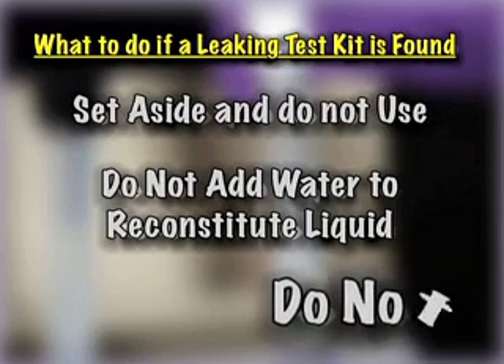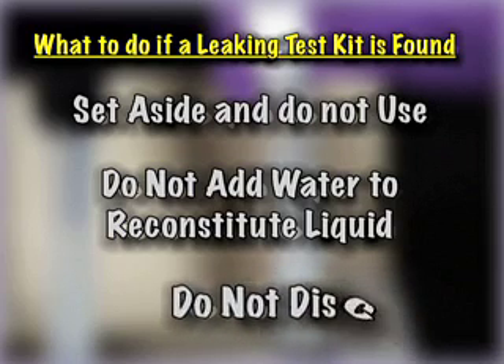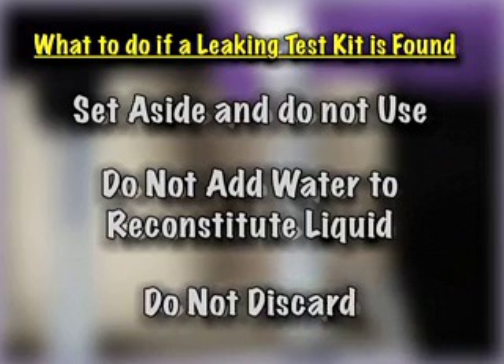Do not discard the test kit. Call Dexel and we may request return of the defective kit for inspection by our quality control department. A replacement kit will be sent to you at no charge.